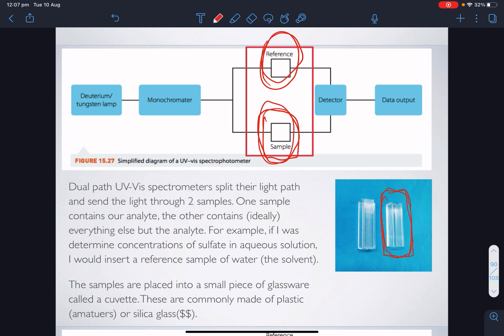And yes, I was very careful. The difference is the clarity, how much light is transmitted through that clear surface, which is much more the more expensive it is. The plastic ones, though, for most activities that we'll ever do and just learning stuff, are good enough. There's no real difference.